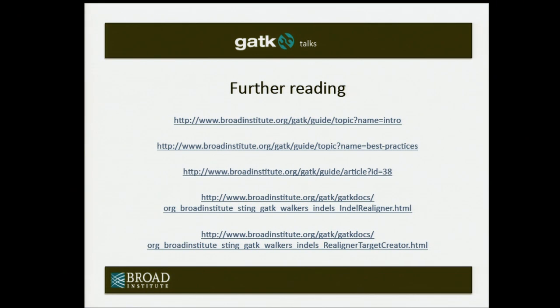So what we generally advise is, if you have deep sequencing, a few samples with a lot of coverage, you run Indel realignment separately for each sample. If you have low pass, low coverage sequencing, then you group them into little batches and run them that way. The Indel realigner has an option so that if you have n files going in, it can keep the same n files coming out, or you can merge them all into one big BAM file at the end. It doesn't matter. But you typically want 30 to 50 reads per position in the data going in, and that'll be enough evidence for triggering it.